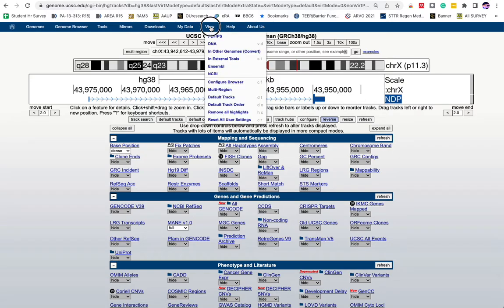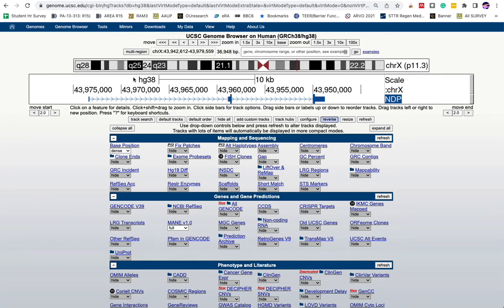Again, you can go to the view menu and get a PostScript download of each of these two files, and these can go in the text section where you write a little intro to the gene that you're working on.